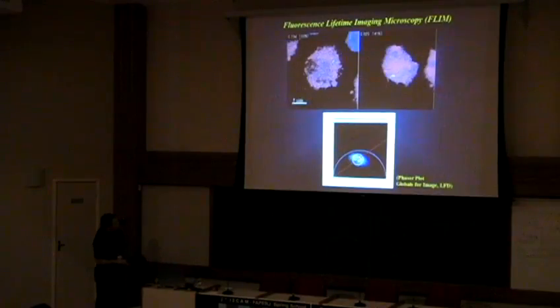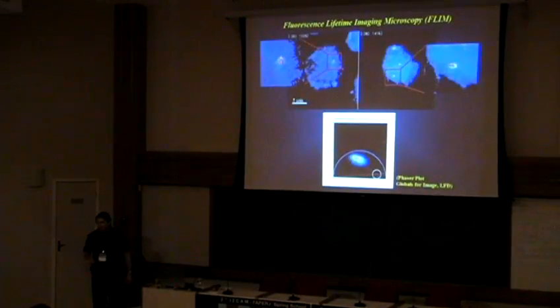When we select that region of our graph, now we are selecting the particle. And then we have the lifetime, much, much shorter than we would expect for fluorescein. That's about 4 nanoseconds, and we have something about 0.2 nanoseconds. That gives a good indication that, yes, we have energy transfer and we have a very short lifetime, and probably this is protecting our particle from photobleaching.